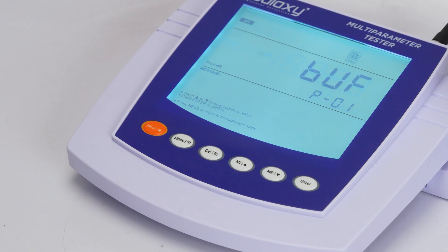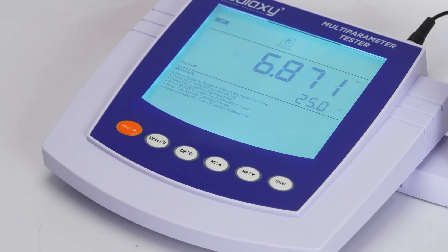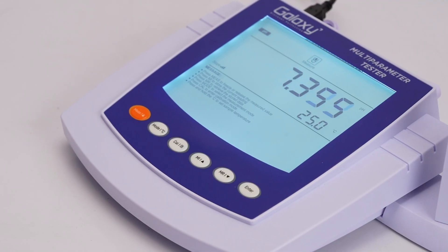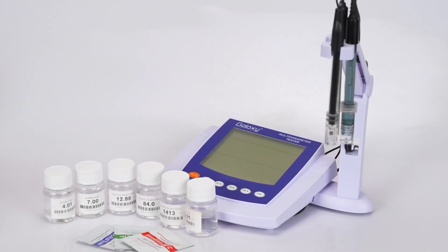Welcome to our hands-on tutorial for the GMP30 multi-parameter. In this video we'll guide you through setting up the device and performing pH and conductivity measurements with ease.